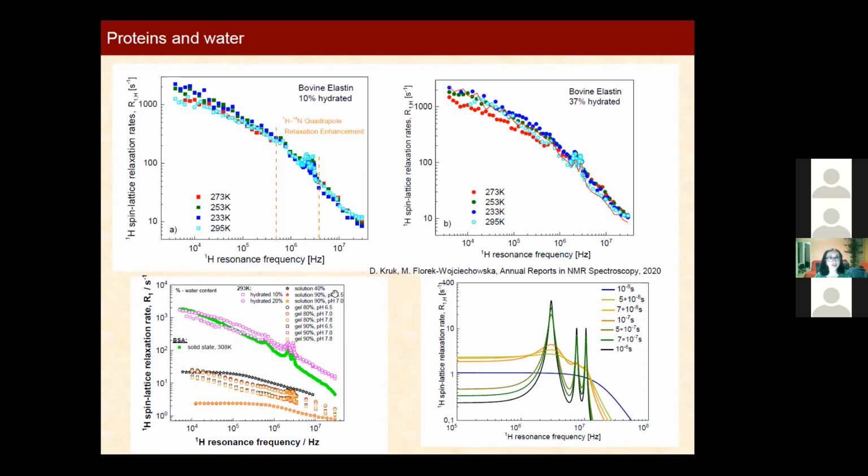If you, for instance, take 40% of water, for this case you have 37 here, and the signal from protein was measured, divided by 40% here, and you get such a line, which merely corresponds to this level. There is the question whether the experiment was not set in such a way that one just measures only water. Because the process can be like that here.